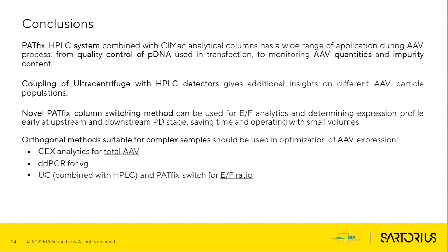I have also shown you how you can couple the ultracentrifuge with the different HPLC detectors to gain additional insights on different AAV particle populations. And finally, I've shown you our novel PATfix column switching method that can be used for empty-full analytics and would allow you to estimate this ratio early in your upstream as well as in your downstream. So this method can be used, for example, if you're doing your upstream setup on a shake flask or maybe Ambr 15 or 250, 5 milliliters of sample is perfectly enough to do this type of analytics.